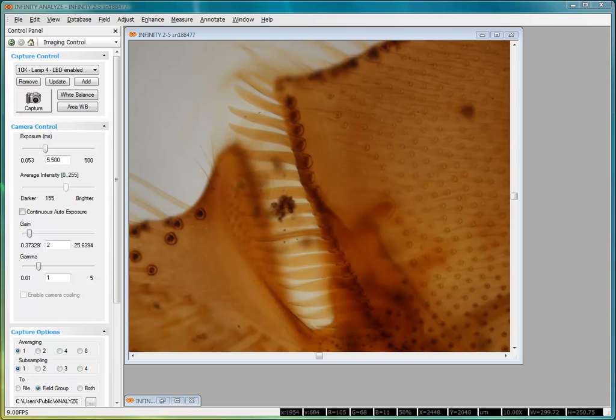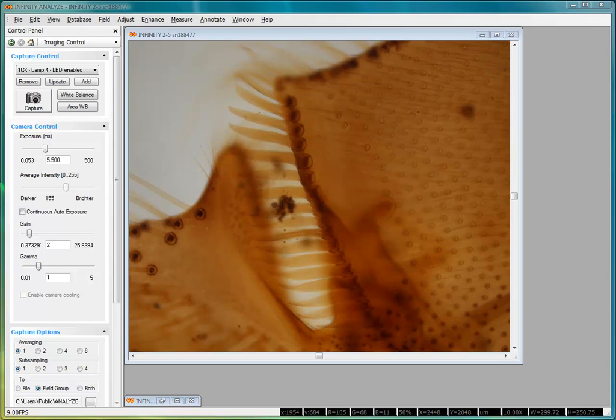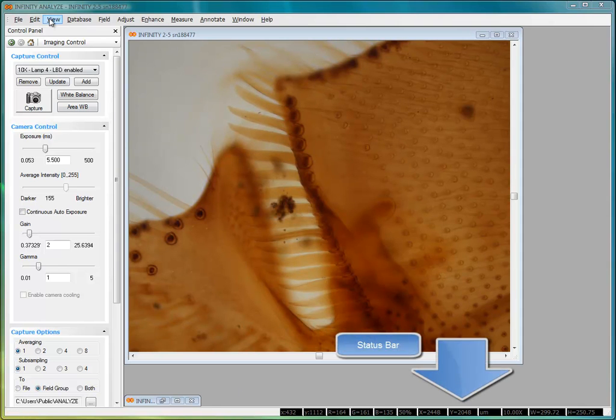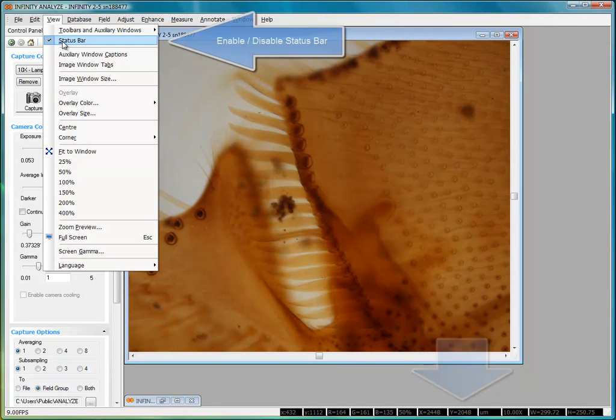We'll begin by locating the zoom control. If your application looks similar to this, you're probably operating in simple mode. In this example, I have the status bar showing at the bottom of the display. The status bar is enabled from the view menu.